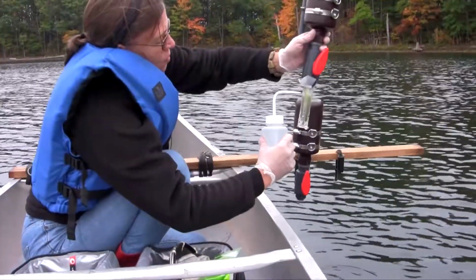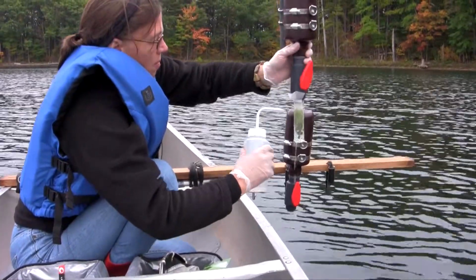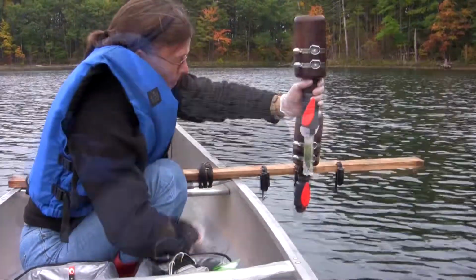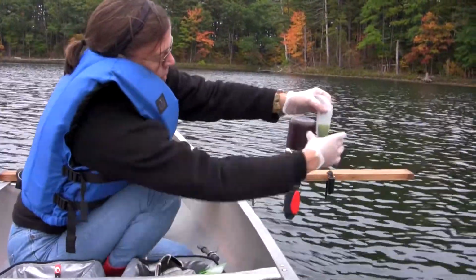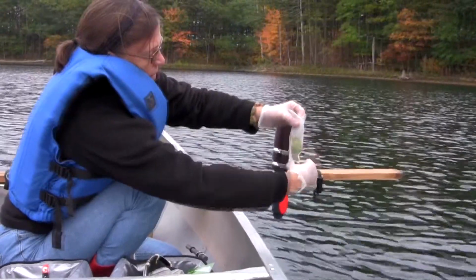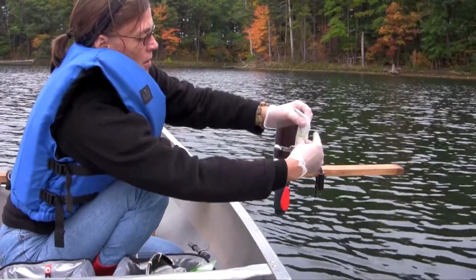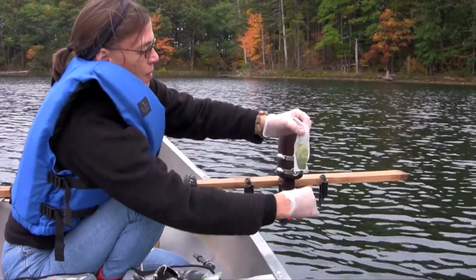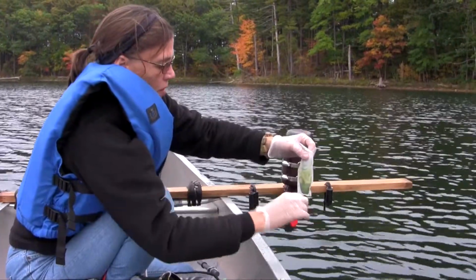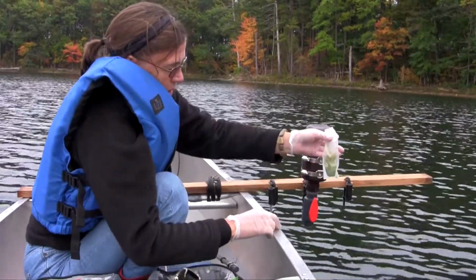One of the things you can do is use these side ports to rinse that sample that's inside your filter cone down into the bottom. That's a lot of phytoplankton. If we put all 3 of these filter cones into the drying chamber, samples like this, probably 6 to 8 hours when you have all 3 of them in there, drying time. So it's about the maximum time that you have for your little heat packs that are inside the drying chamber.